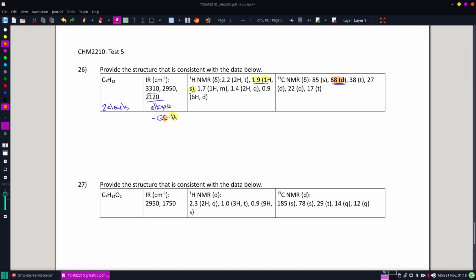Now this other one that's listed as a singlet, it's got to be the one right next to it, because the triple bond has it very deshielded. But it's not connected to any hydrogen, which would make sense. It's on a branch. It's off to the end. Alright, but I still have 5 carbons to take care of, and 11 hydrogens. That's got to be all these other guys.